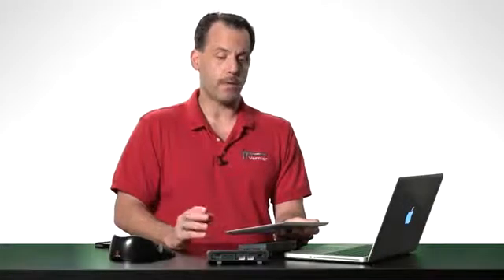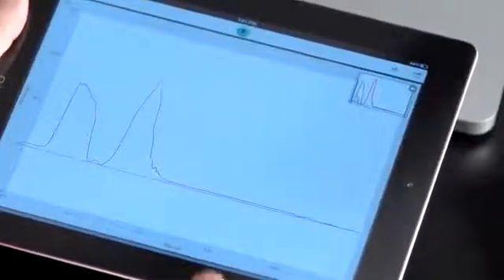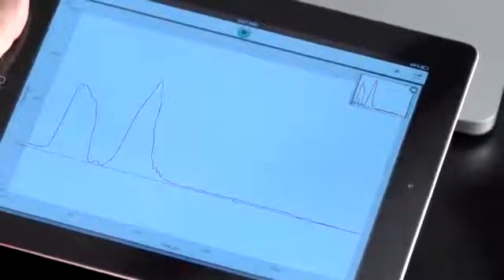If I want to see what LabQuest2s it can see, I just have to tap in the top corner right here. And now you can see it sees two things, Group 1 and Group 2. Both of these things are called Vernier Data Share, but really they're LabQuests that the iPad can see. Just like I showed you on the Macintosh, these are the same LabQuests called Group 1 and Group 2. So let's just connect to Group 2, like I did with the Macintosh. And here you can see the same data that I showed you with LabQuest Viewer on the Macintosh, right here on the iPad.